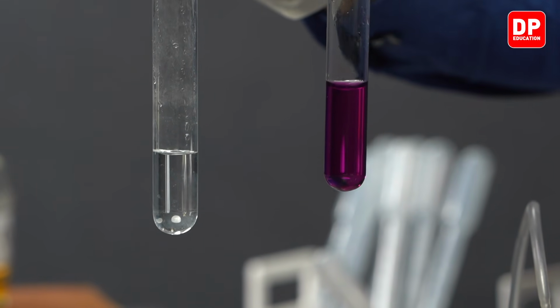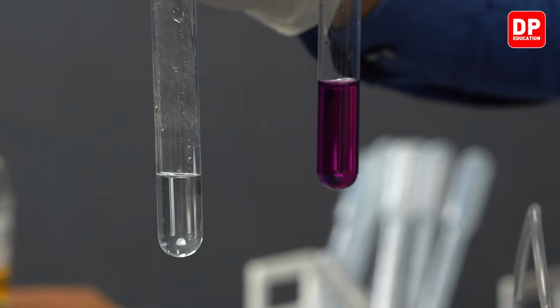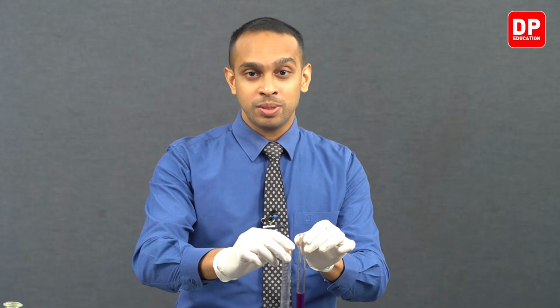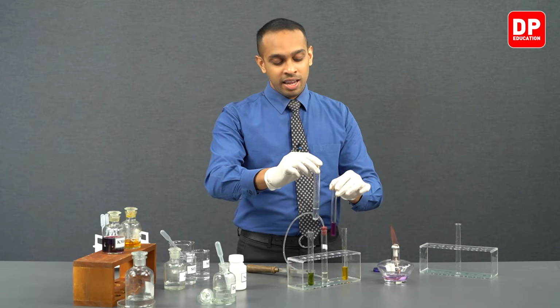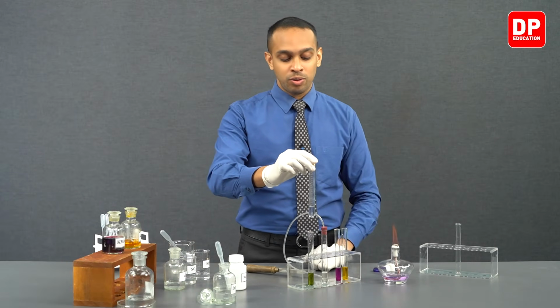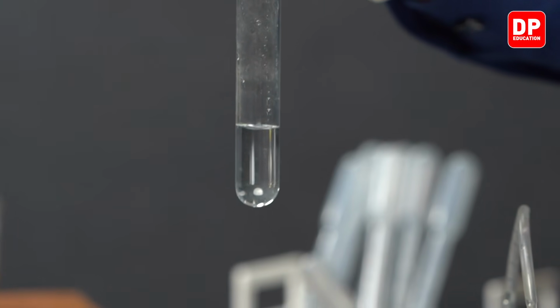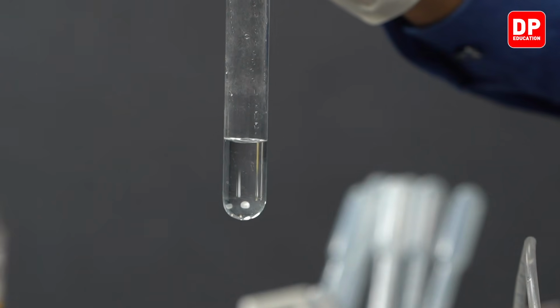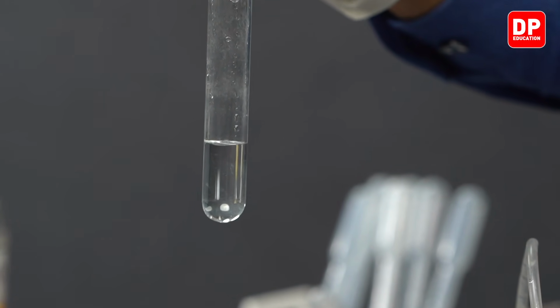We can very clearly observe that when sulfur dioxide is reacted with acidified potassium permanganate, it gets reduced to form Mn2 plus ions. Mn2 plus ions in aqueous medium appear colorless, although Mn2 plus aqueous ions can form a complex which is pale pink in color.